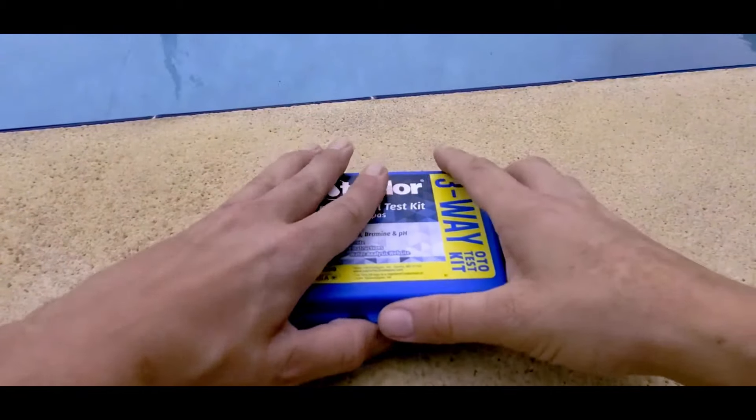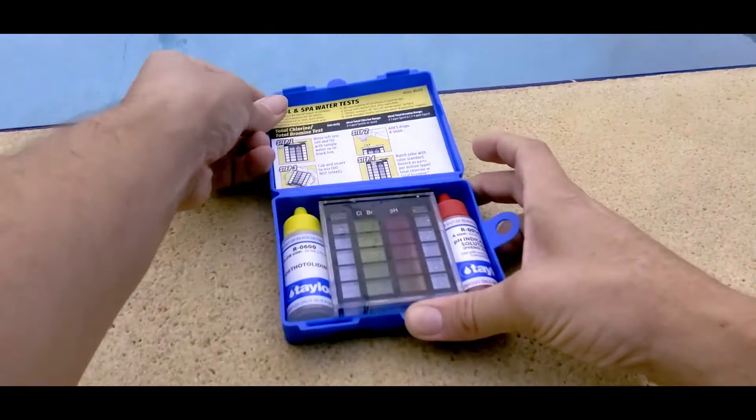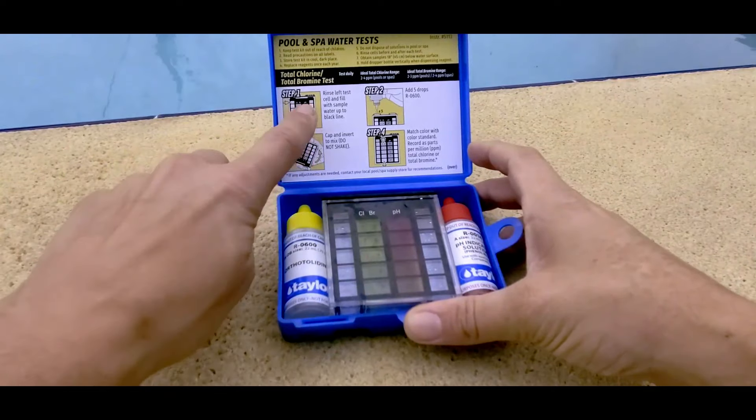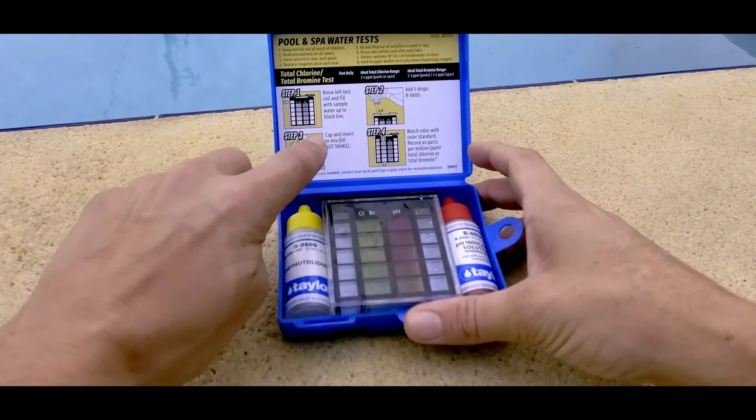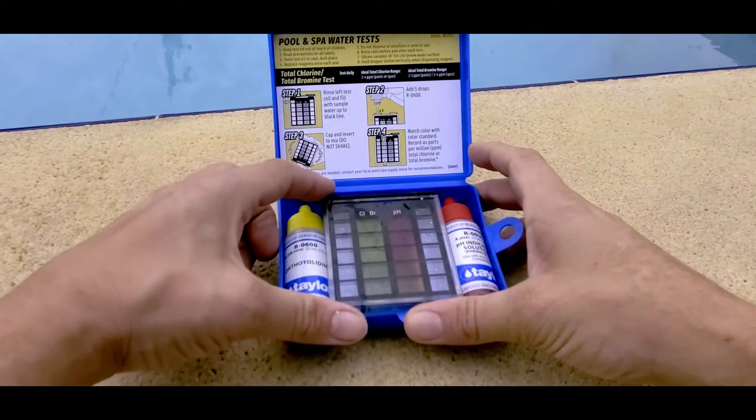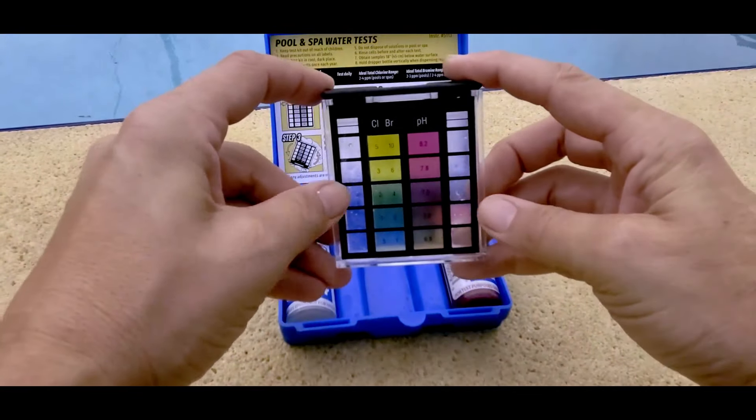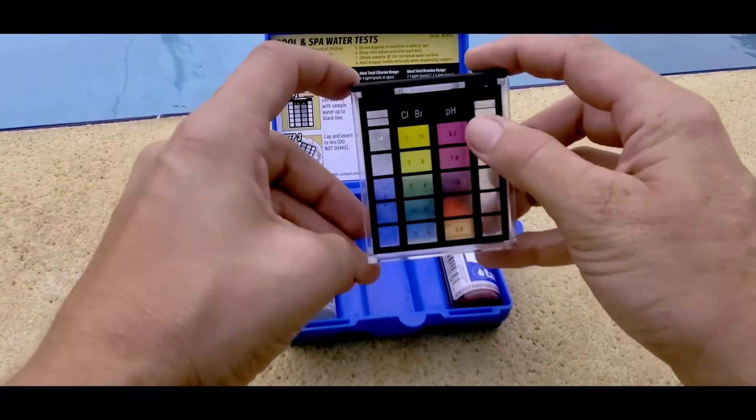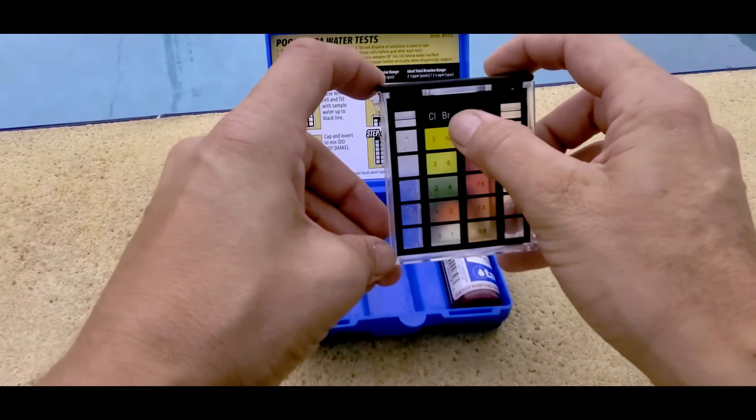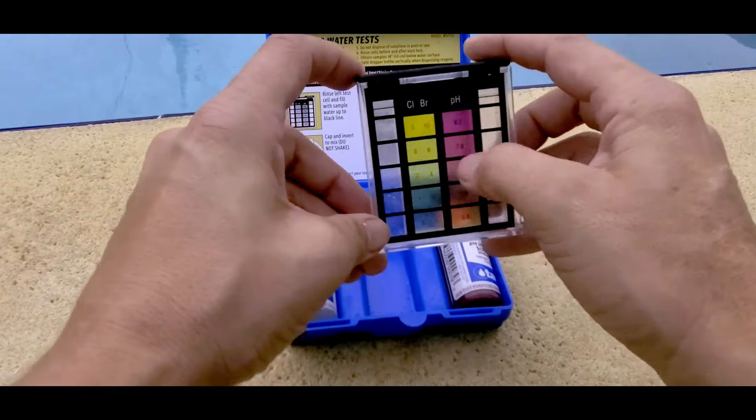Alright, so let's open this kit up and see what's inside. This kit actually has instructions right here, which make it really easy to use. And this is the actual viewer. So this shows chlorine and pH. It also has bromine, but most pools are sanitized using chlorine.